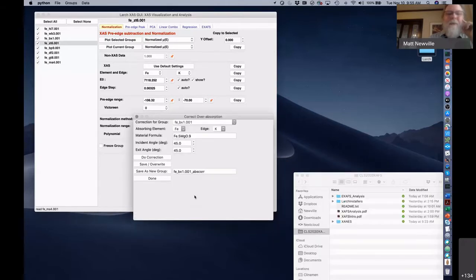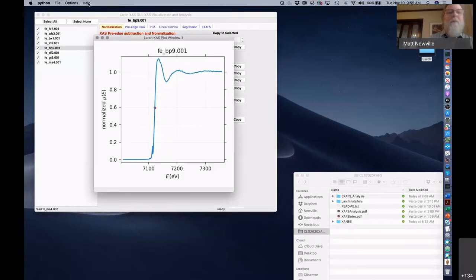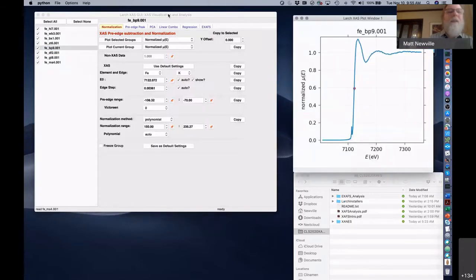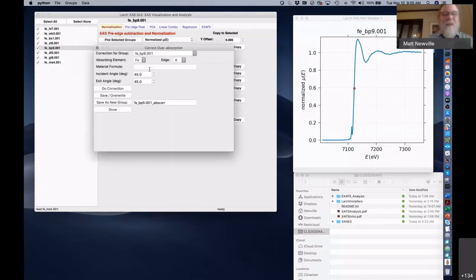The demo is always going to fail at one place. Really, this works. Fe 0.5. Actually, so for those who know, this uses the Fluo XANES approach. There we go.